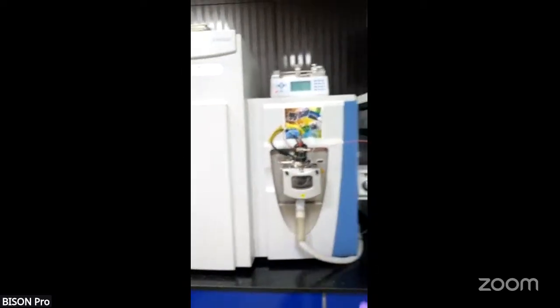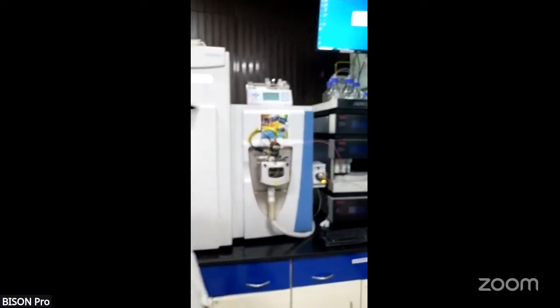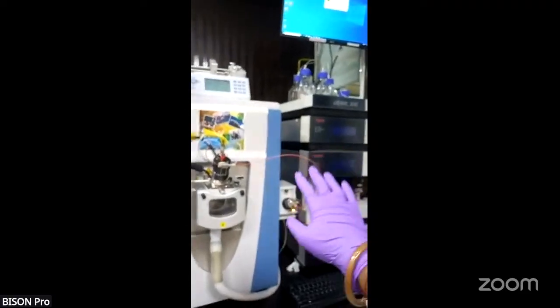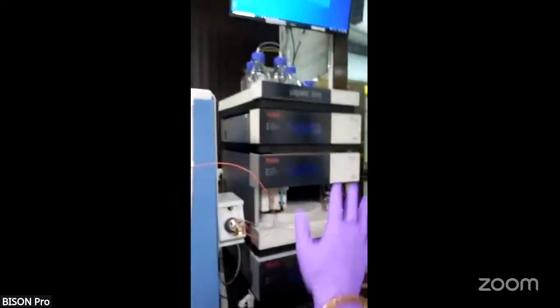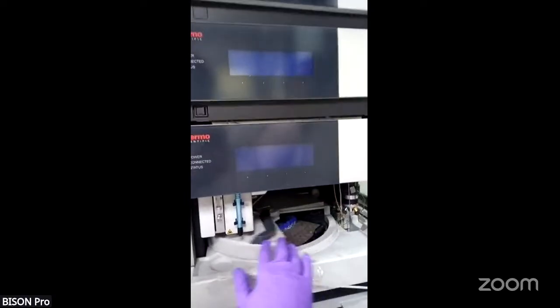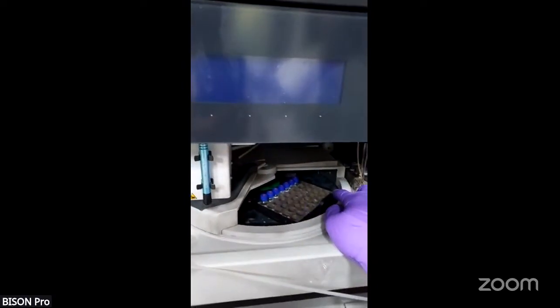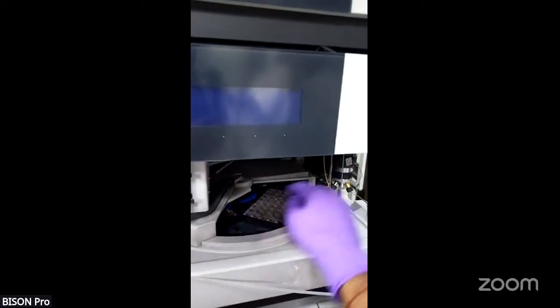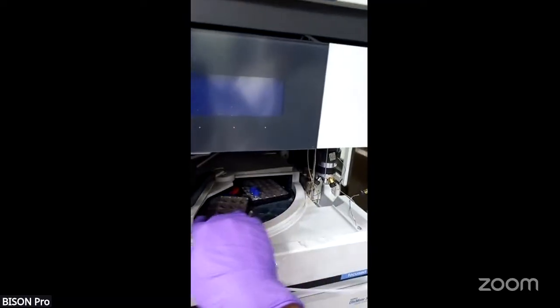Here is the Q Exactive. You can see our mass spectrometry handler which has been opened. This is a UHPLC, an ultra high performance liquid chromatography system. This is the sample loading tray. You can find it has several colors such as blue, red, and green. At a stretch, 200 samples can be easily loaded in a day.